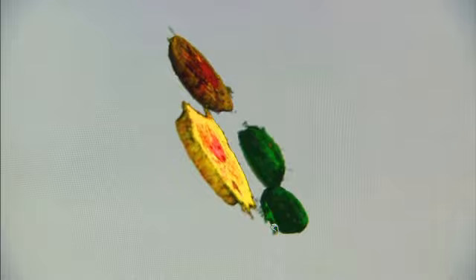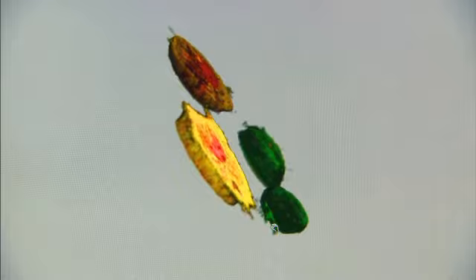Native fluorescence that's coming from the cell itself, and thinking that the fluorescence, the autofluorescence, is actually what they put into the cell. And until you can look at the full entire spectrum and the spectral components that are emanating from that image, can you really discern what is actually fluorescing and what is not fluorescing.